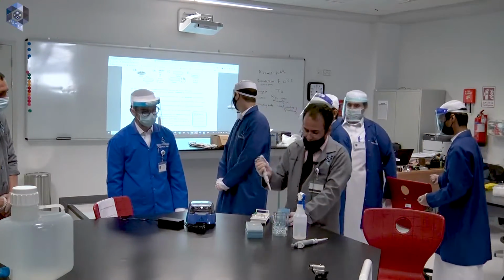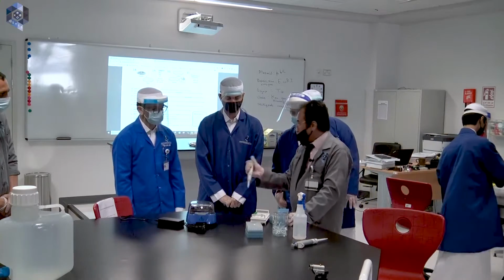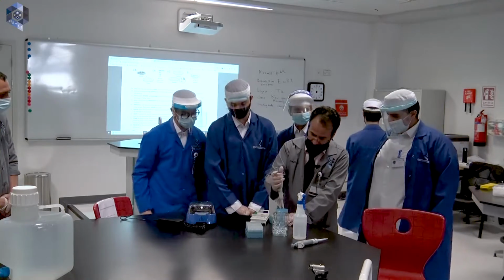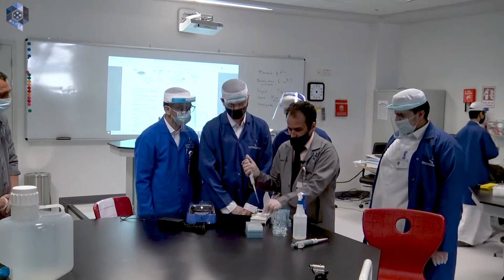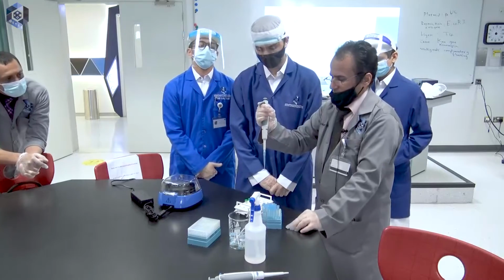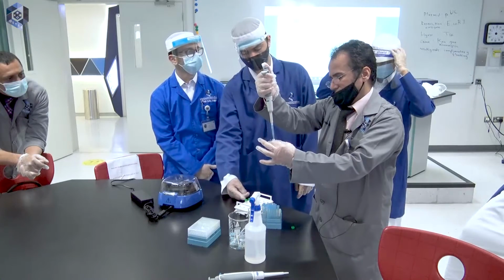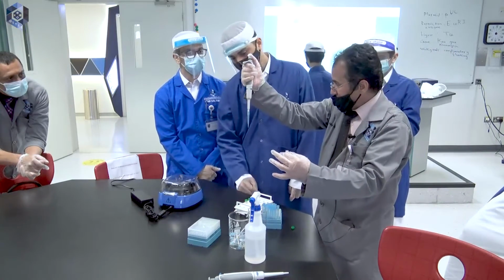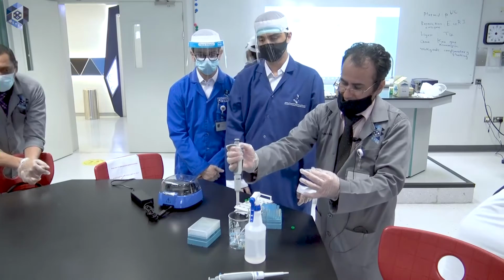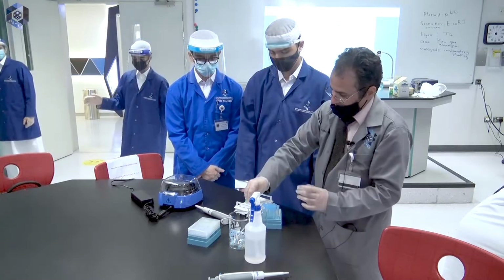I want one of you to discard part of the liquid part of the supernatant here. I will demonstrate this to you if you hesitate. About 150, depending on the amount of the pellet you have. Like this, I took this volume from the supernatant, then discard it here. Okay, I return it.